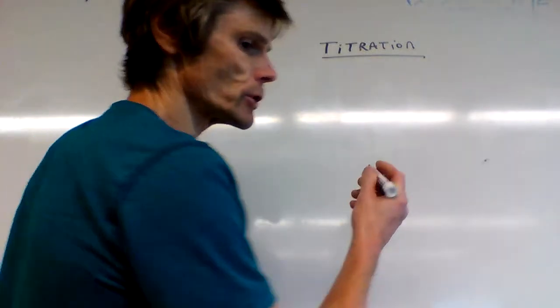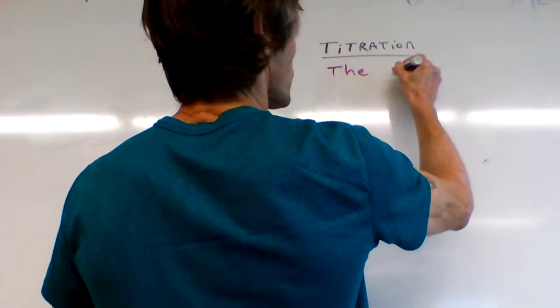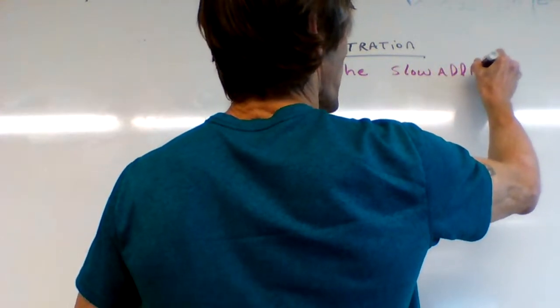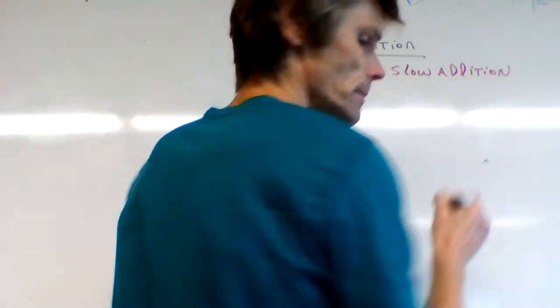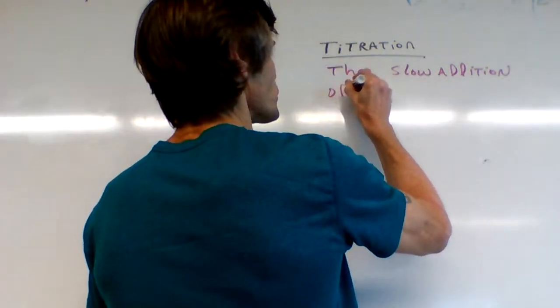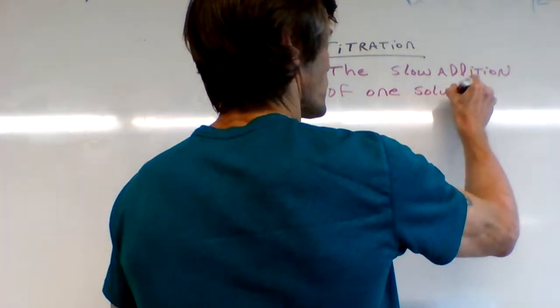A titration is the slow addition of one solution.